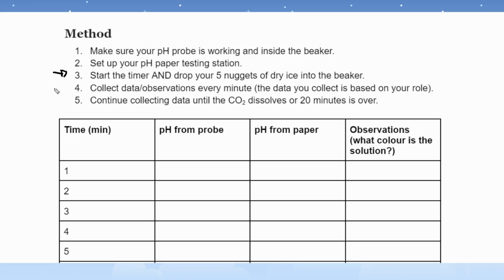After the first minute, you're going to collect data. So you see here, minute 1. Then you're going to have 3 people who are going to fill these 3 things out separately, right? So previously, I don't remember who was doing what. So let's say this is Mr. Chow, this is Mr. John, this is Mr. Aliot. We're each going to fill out just our own, and then we'll share our data with each other, if you have time between making observations.